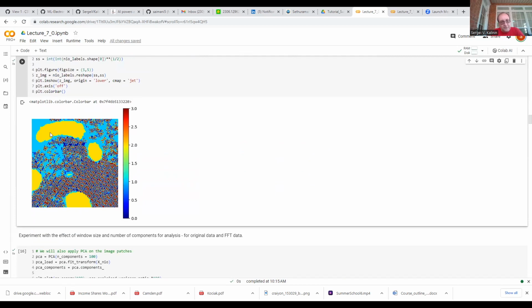So we can still see the difference between the nickel oxide and the perovskite. But now we start to divide the perovskites, and this type of structure is essentially the Moire effect. What happens in this case is that our lattice has some periodicity, and our sampling grid has periodicity. These periodicities are not the same. So if you superimpose two periodic structures on top of each other, then you start to have this type of beating effect, where a larger range periodicity appears in the system.